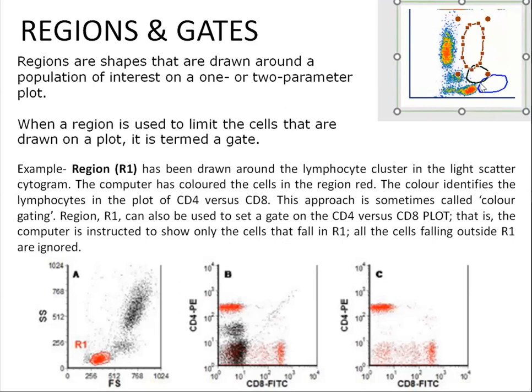I draw a small drawing around this particular population. Okay, I'll show you during our analysis. So this is something like the one which you're drawing, a shape that is drawn around this particular population is called selecting a region.